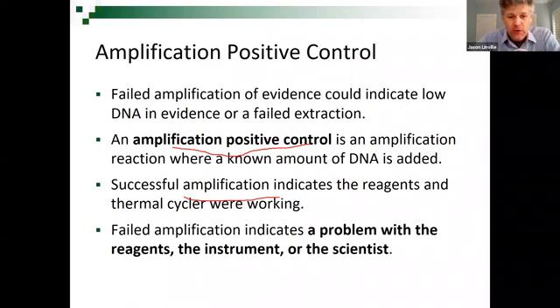So if everything works, then we know, and there's going to be a theme here, the reagents are working, the instrument is working, and the person has done it correctly. If your positive control fails, then either there's a problem with the reagent, a problem with the instrument, or a problem with the goofball who was setting it up. When students in our laboratory run reactions, they always assume it's them. They always go, oh, there's something wrong with me. No, oftentimes it's an instrument problem, we used the wrong reagent, or the reagent has gone bad. So it can be any of those three.